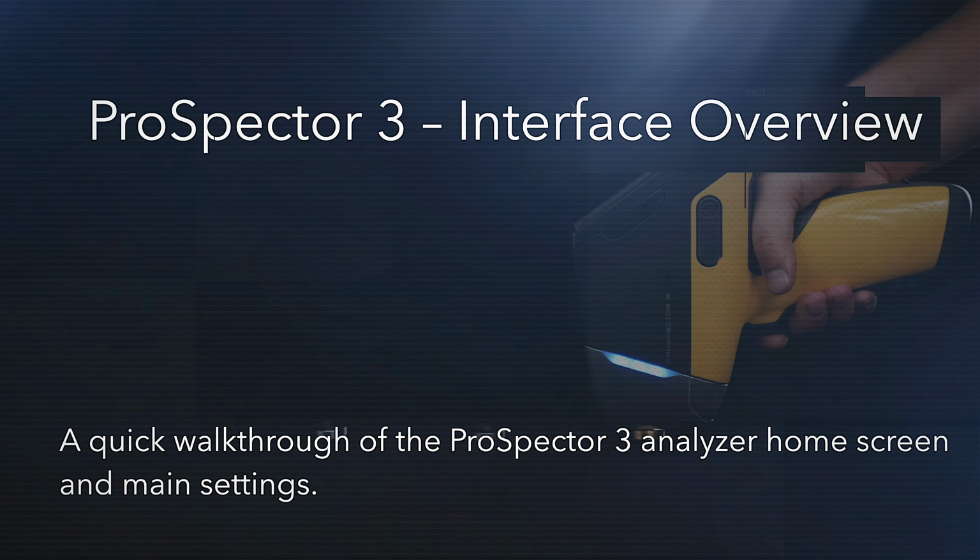So the next we have the start stop button. Start stop button appears on the screen in any calibration. For example, we'll go into alloys without light elements, and you see on the screen there is a start button and arrows.